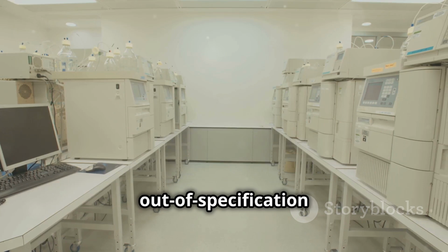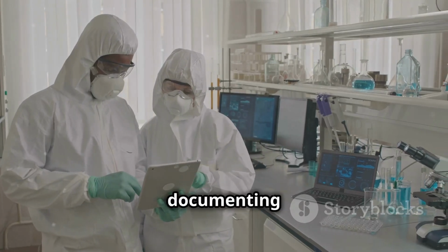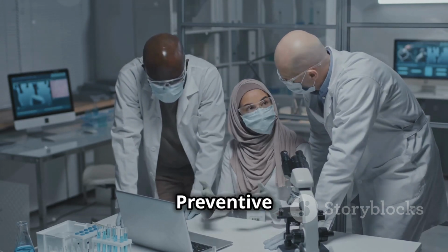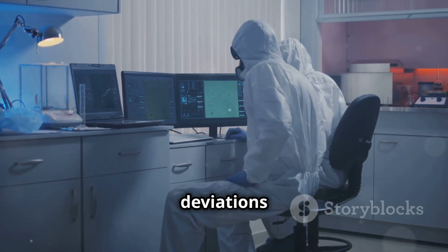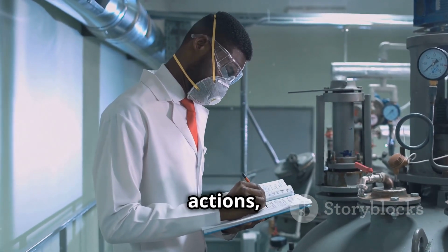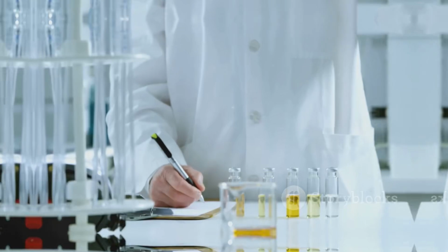Handling deviations and out-of-specification results is crucial. Deviation protocol involves documenting procedures for immediate action on deviations, including corrective and preventive actions, or CAPA. Conduct a thorough root cause analysis to investigate deviations and implement corrective measures. Make sure all findings, corrective actions, and any resampling required are meticulously documented.